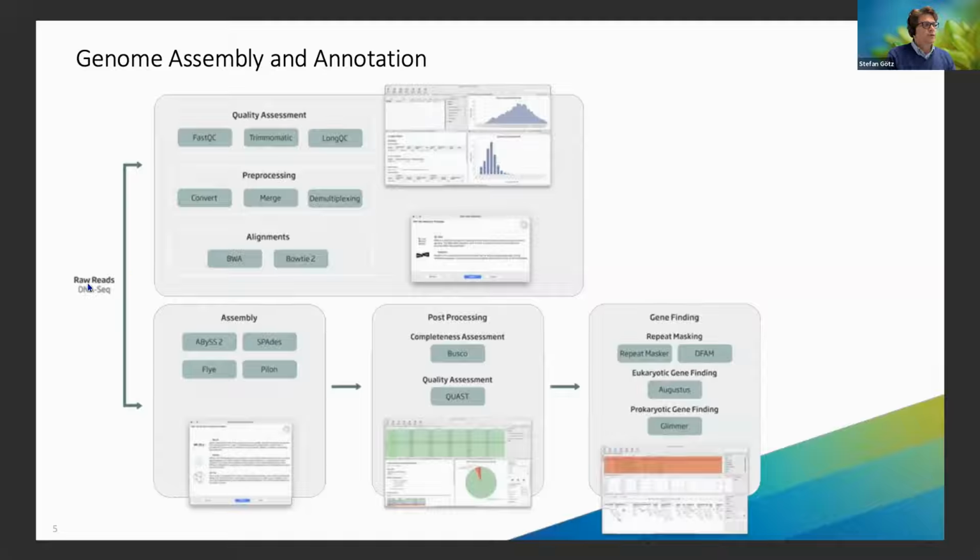And then you can get into those by using raw reads. And it's not a fixed pipeline, like you might be using when running Nextflow or some pipelines, but it's actually just tools available for you. And there's always certain input requirements, and then you get the raw output as well.